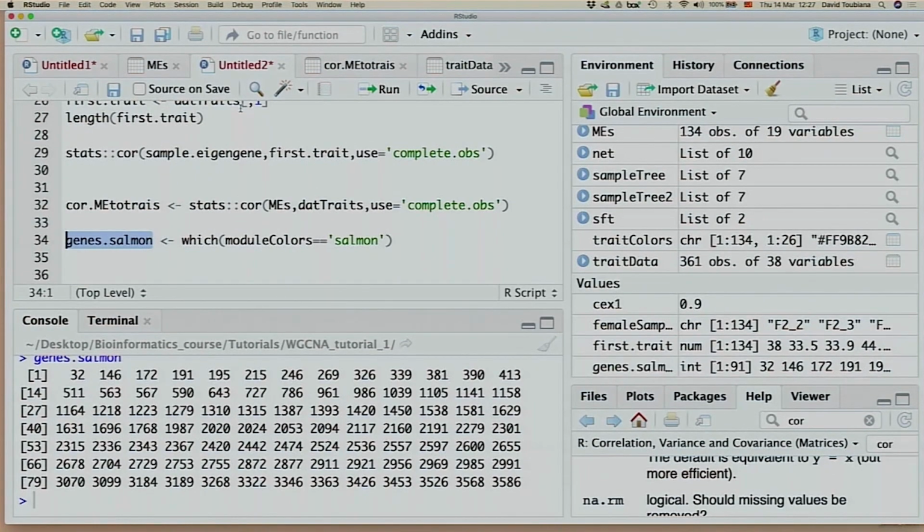You can just use the PDFs, right? So originally, the plan was also to show you a tool where you can visualize networks. It's called Cytoscape. It's a graphical user interface tool.